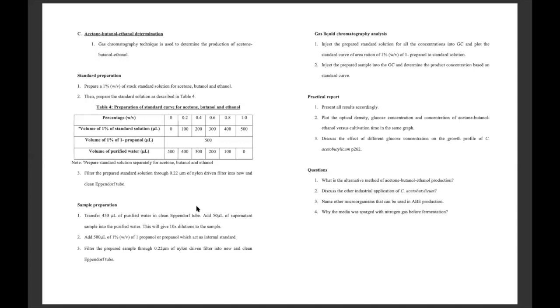Okay. So any questions regarding the preparation? Are you guys clear about the internal standard and also the dilution and the filtration?